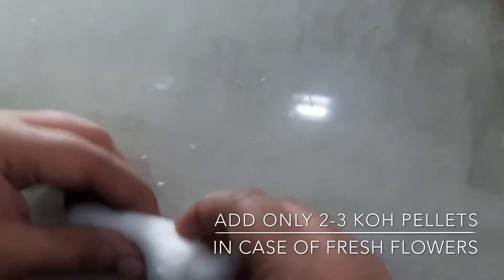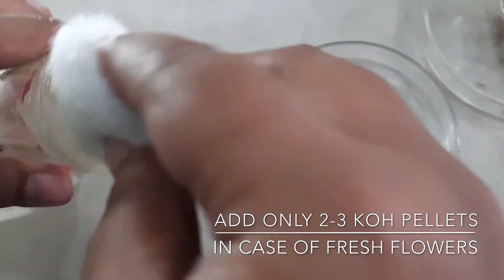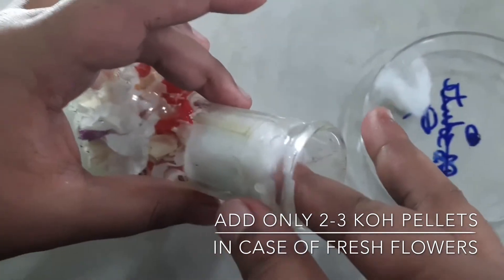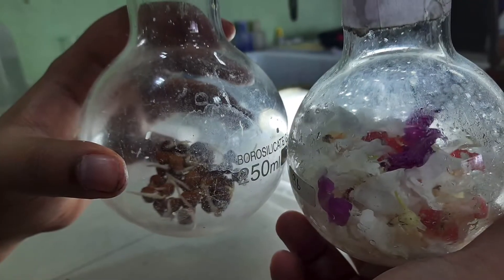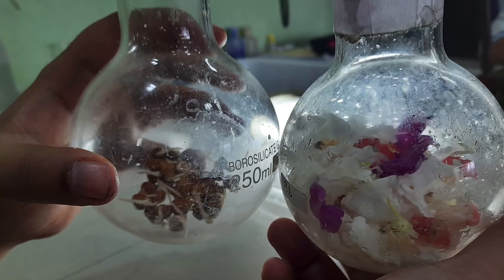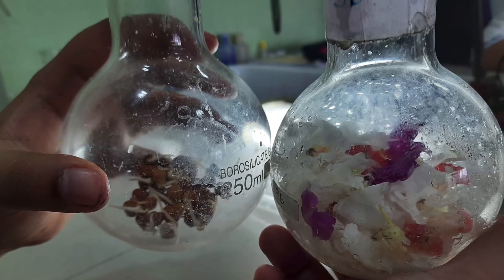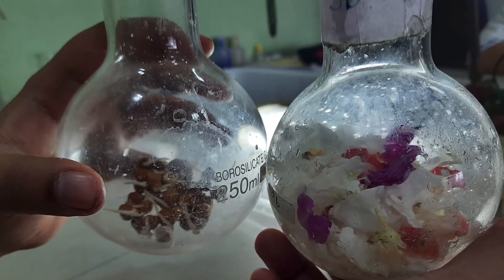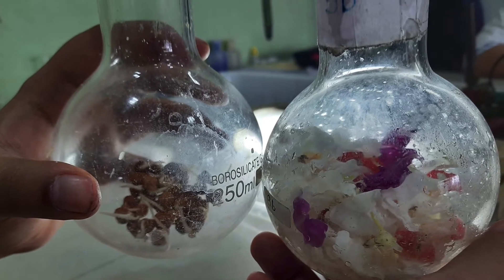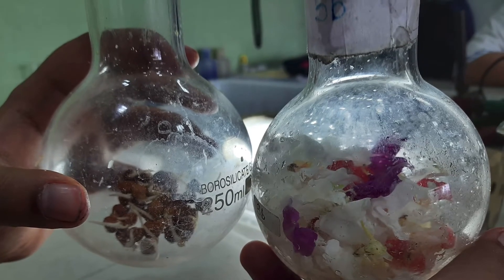What we do is use two to three pellets only for the flower one, so that we get a greater respiratory quotient in case of the gram seeds. Try it yourself and see what is actually the difference when you use the same number of pellets for both, and when you use two to three fewer pellets in the flower one.